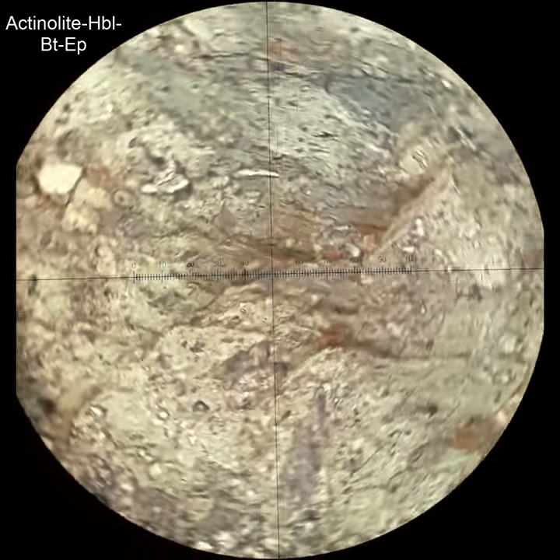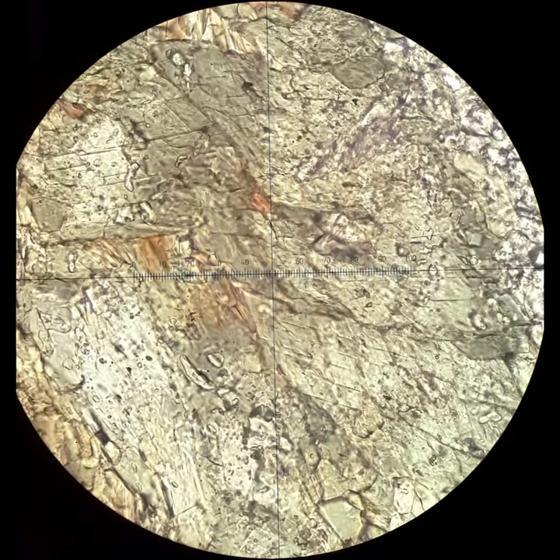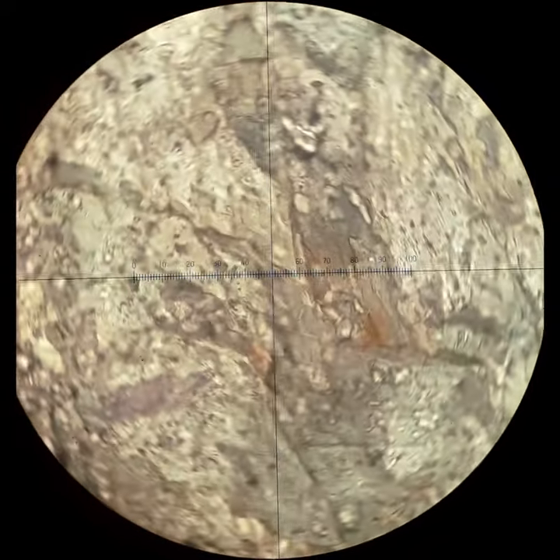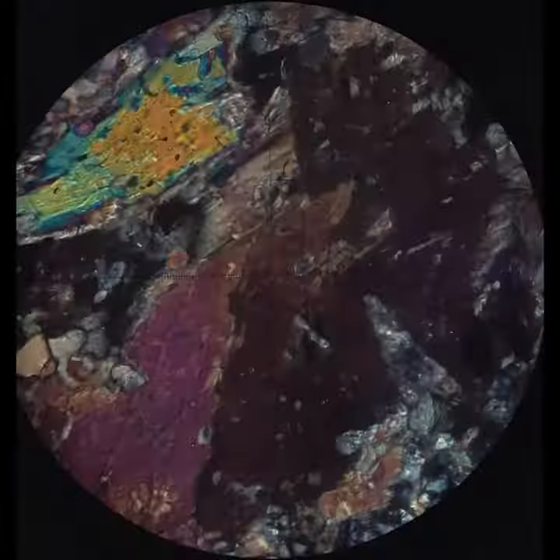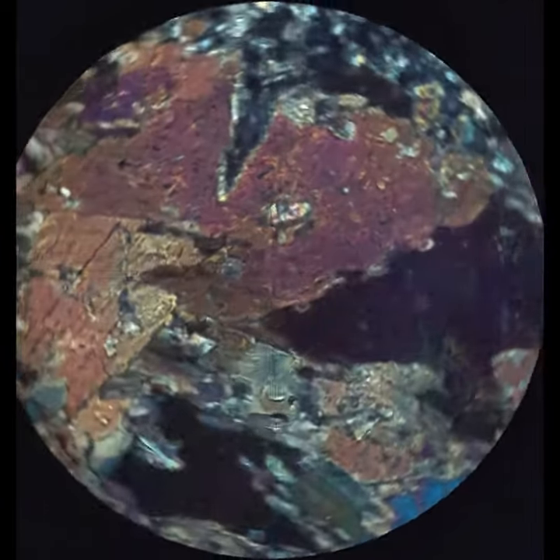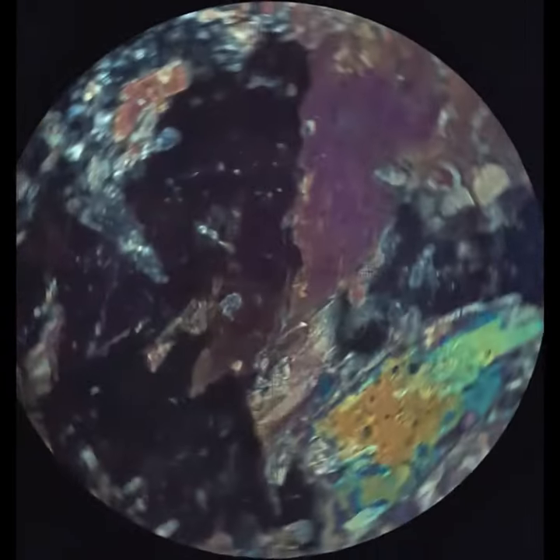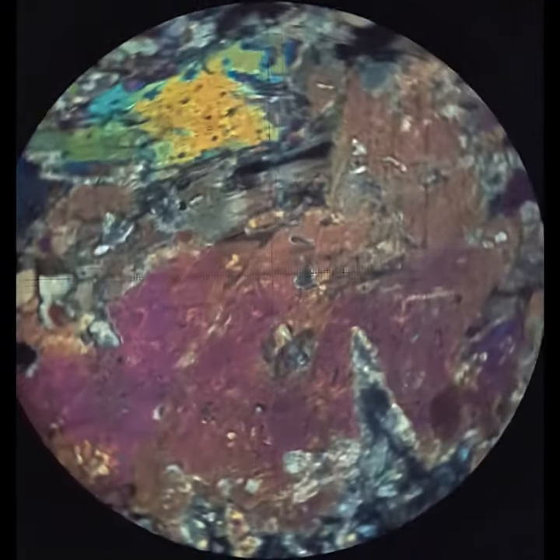Now this is an odd sample. You're looking at end sections of amphiboles, and there's super pale green ones, and then there's sort of blue-green ones on the outside. So the cores are actually actinolite, that's a greenschist facies amphibole, and the rims are hornblende, which is an amphibolite facies amphibole. And so the actinolite cores tend to be a little bit brighter in their interference colors than the hornblende rims.